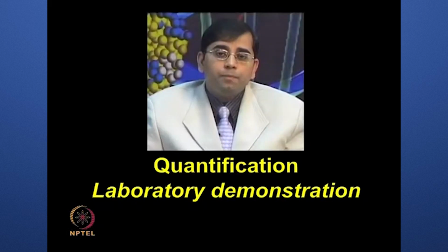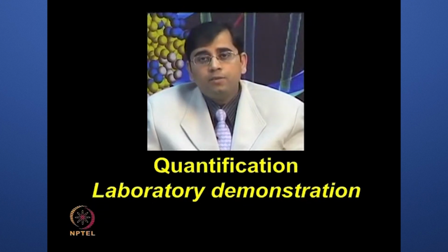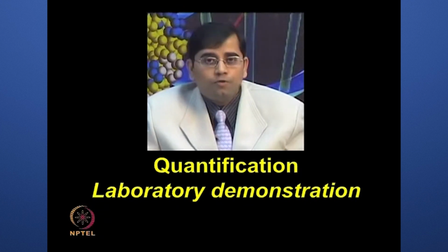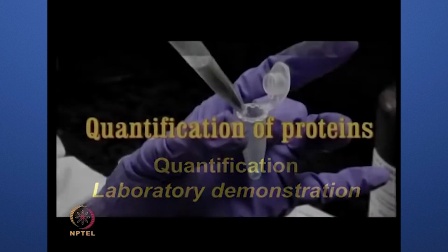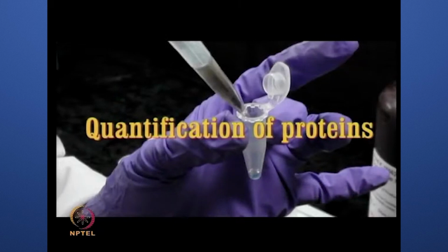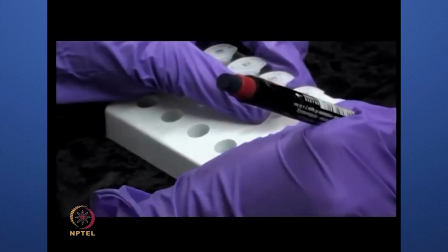So, how to perform the quantification? Let me show you one video, a laboratory demonstration of how to perform protein quantification. Quantification of proteins. After the protein sample has been extracted from its source, it must be quantified to determine the protein content before any further processing.